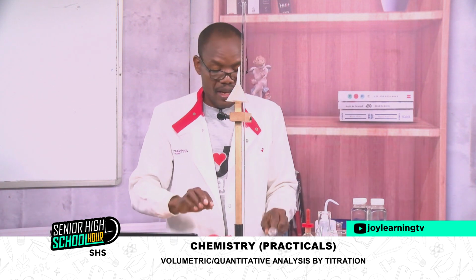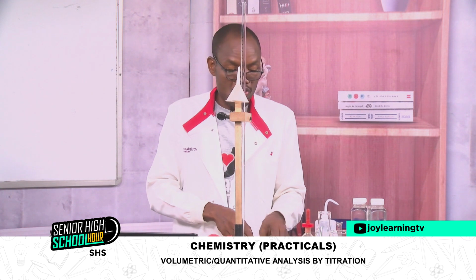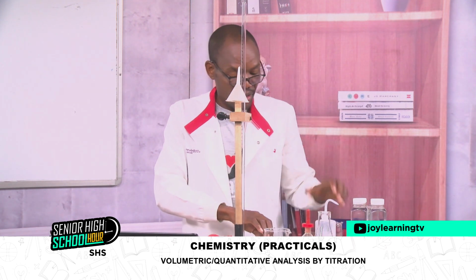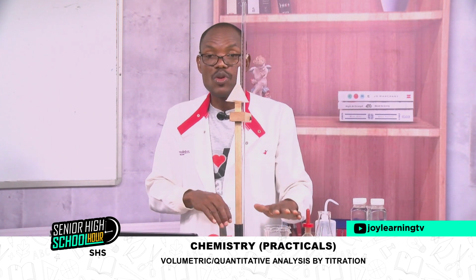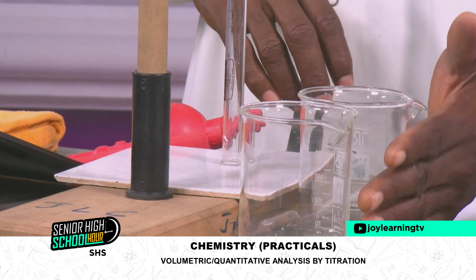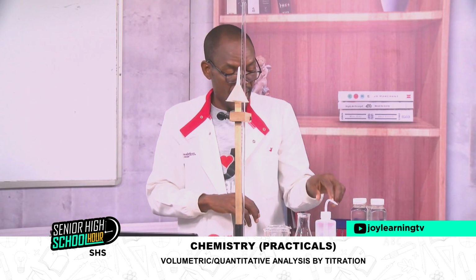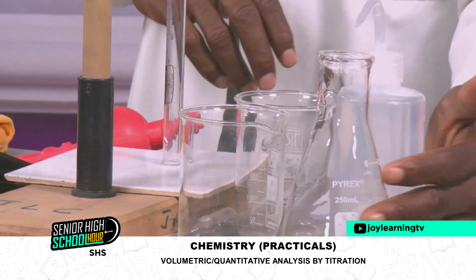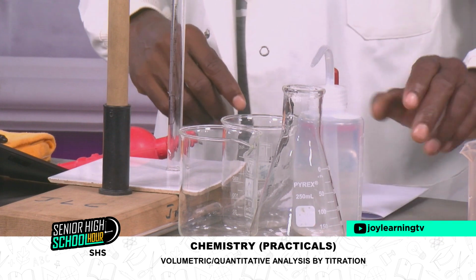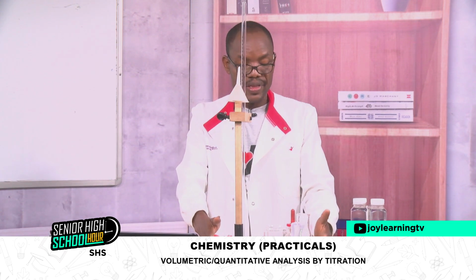Then my pipette here will come like that. The pipette should be located between two blocks so that it will not roll and fall. Then I'll have my beakers like that too, because one will contain the acid, the other will contain the base. So always you have two beakers, whether they are plastics or they are glass, it's enough. Then I'll have my conical flask there. Then I have my wash bottle there. And of course, the indicator will be stationed somewhere because you are not the only one using the indicator. So this is our assembly. This is how everything should be assembled.